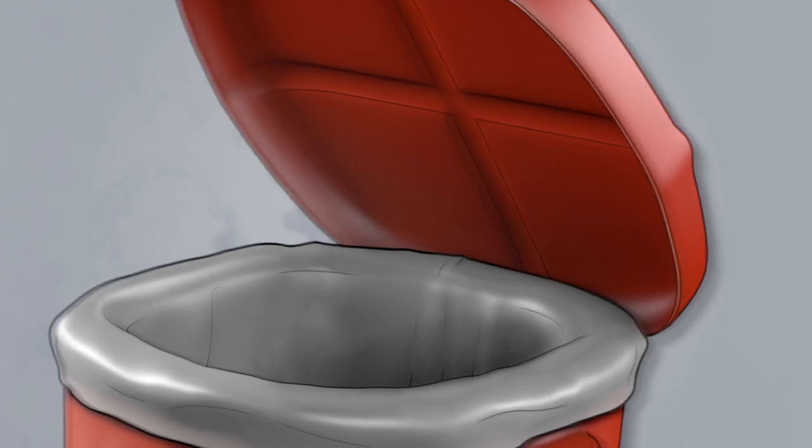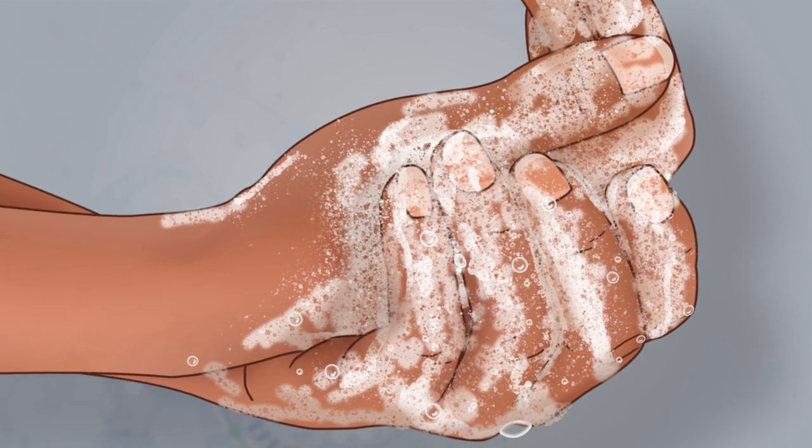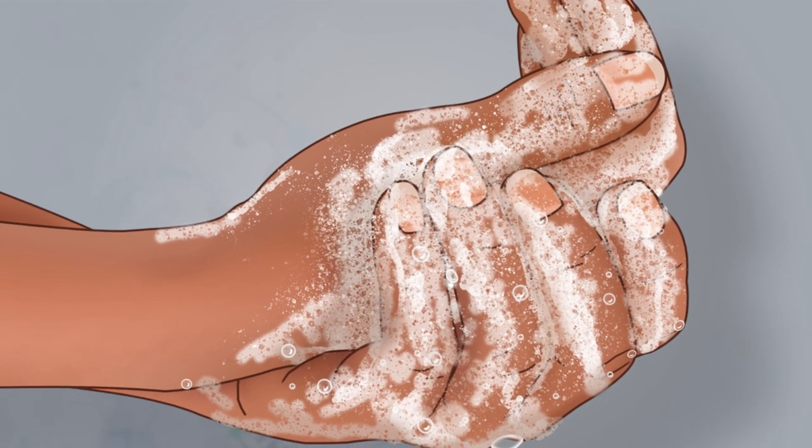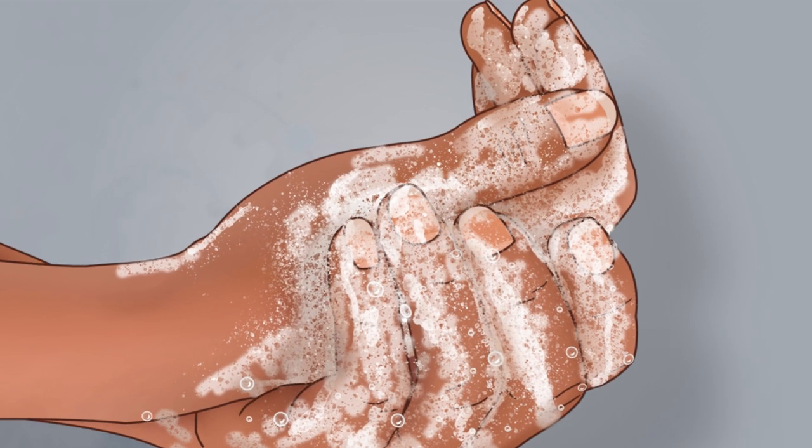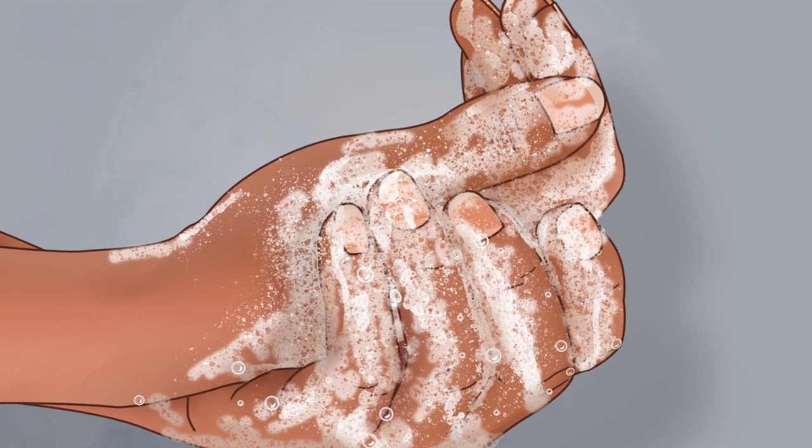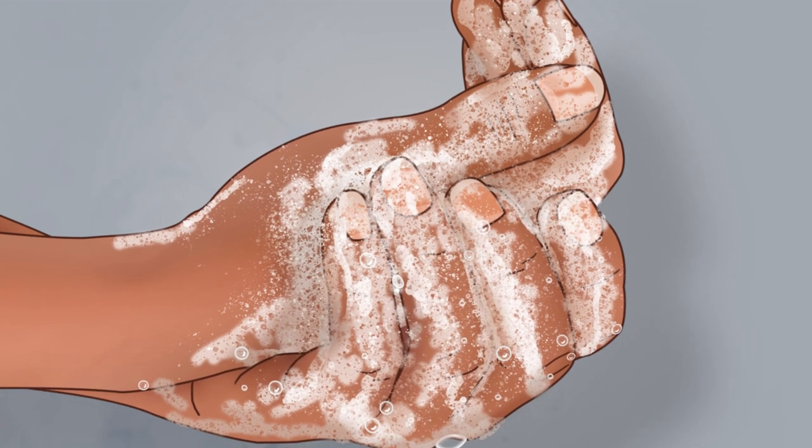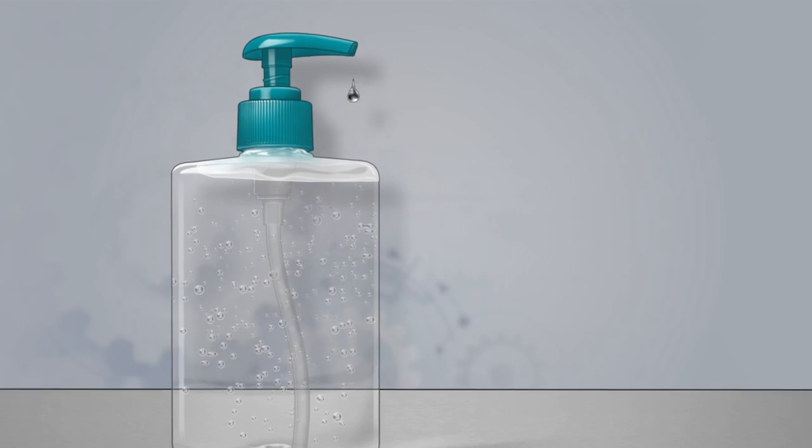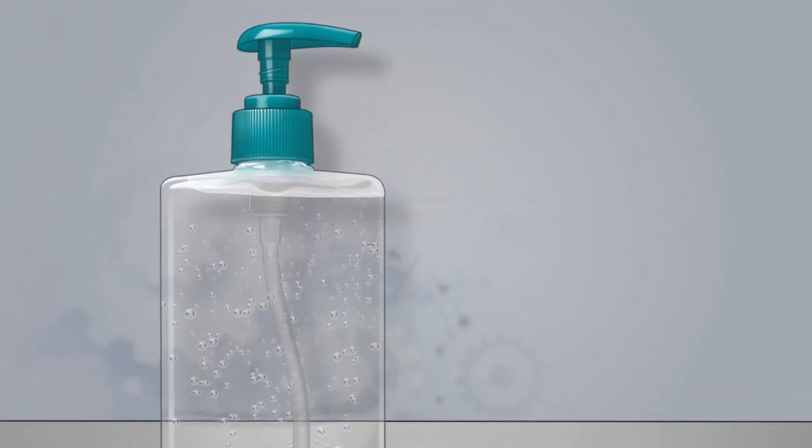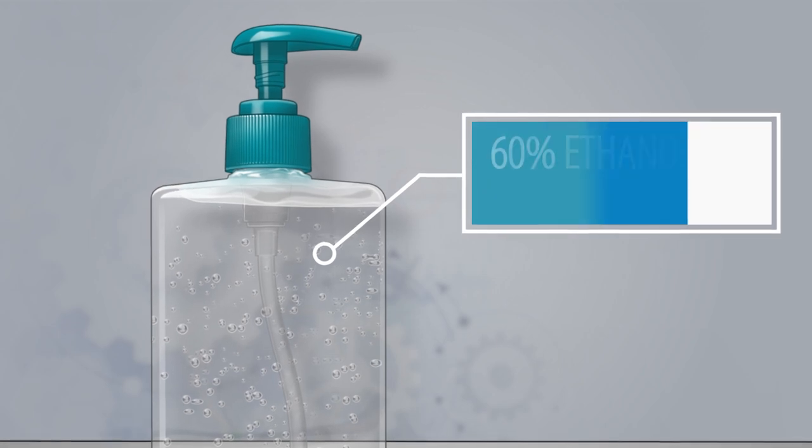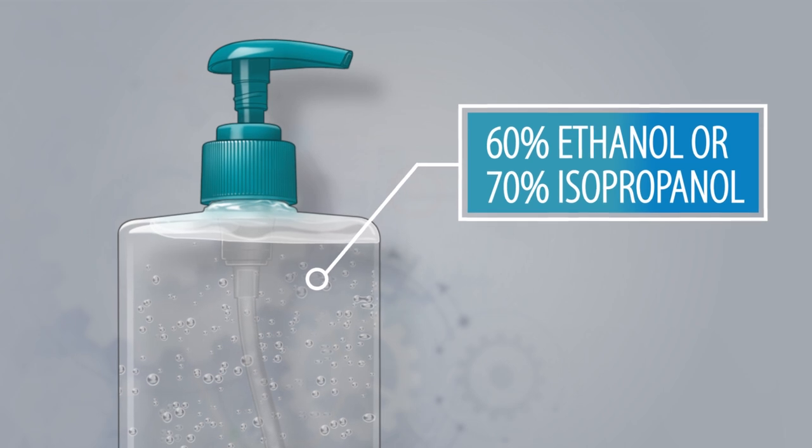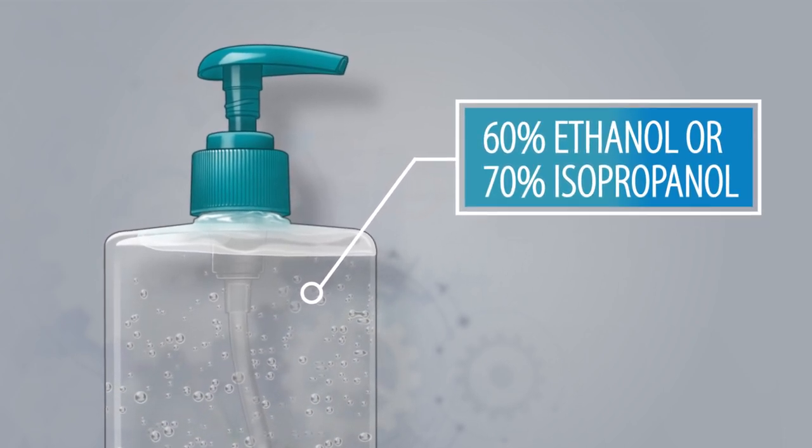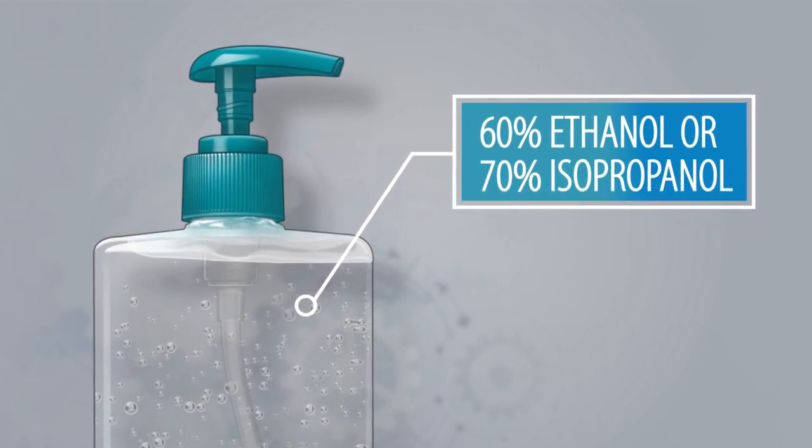Last, wash your hands with soap and water. Lather the backs of your hands, between your fingers, and under your nails. Scrub for at least 20 seconds. Washing your hands with soap and water is the best method. However, if soap and water are unavailable, an alcohol-based hand sanitizer containing at least 60% ethanol or 70% isopropanol can be used as a temporary solution until soap and water are available.